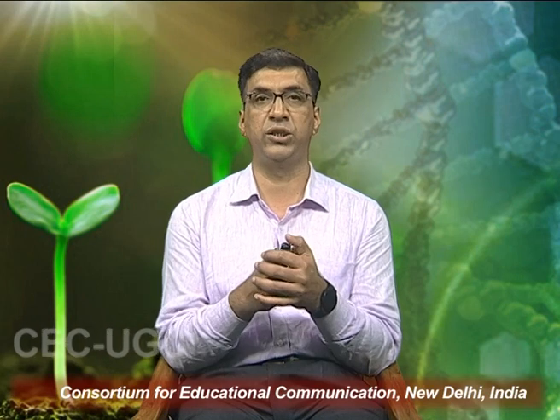Now, as I told you, the path travelled by the vapors is very short because the distillation still and the condenser are placed very close to each other. This process can be carried out at very low temperatures and at low pressure, which will eventually cause less thermal degradation of the constituents. If the sample is highly viscous, it can be easily handled in this technique.